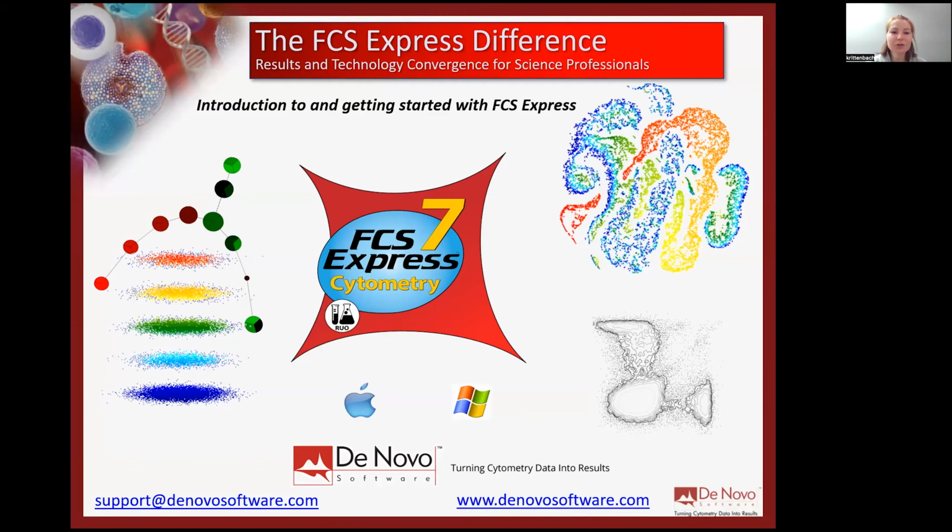So today, this training is going to take 2 hours, and we're going to start with how to get started in the software, and then also we can move on to some more advanced analysis techniques in the software. I'm also going to just give you a little bit of background on the site license that's available at UChicago.